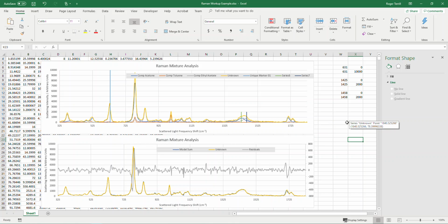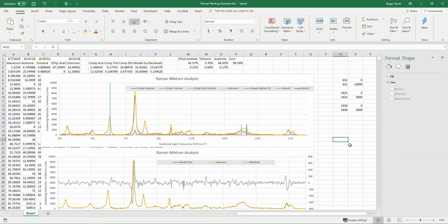All right, so I found some peaks. You guys can probably do better than me on this. So that is all we really need to do with this mixture. So excellent work so far. Then you want to answer the questions in the report and then turn in the questions and this spreadsheet together, and have this table in the Word document that you make the mini report on.